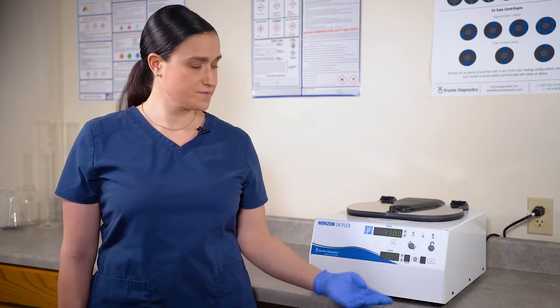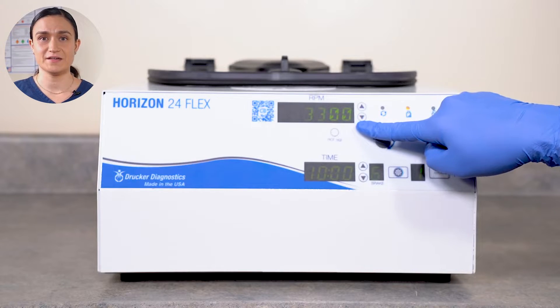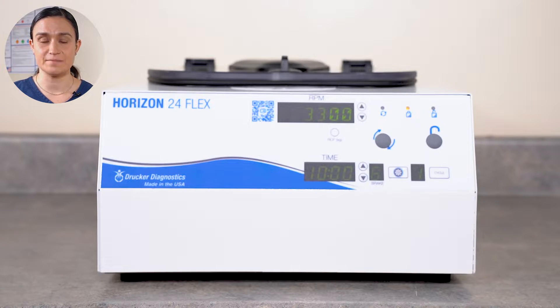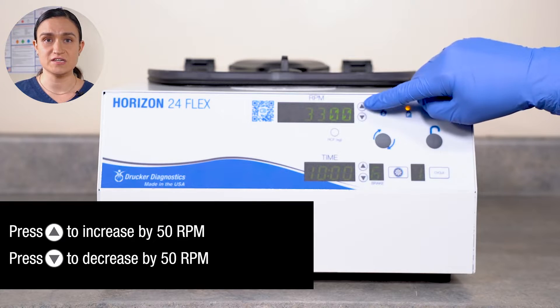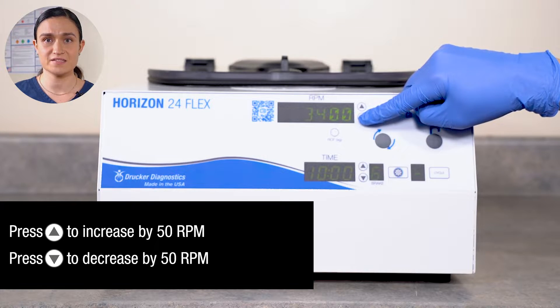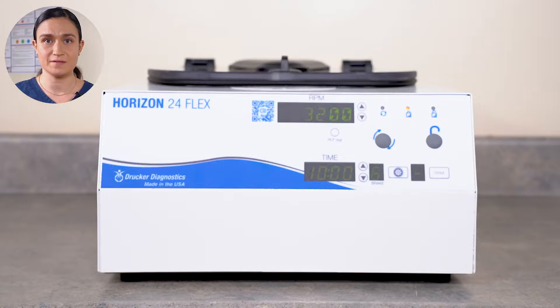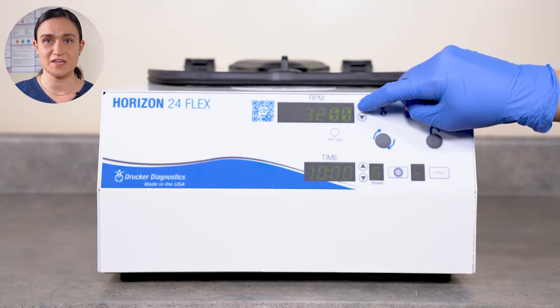When the tube holders are properly seated, you will be able to move them slightly — this is by design. That's what allows them to rise into their horizontal spin position. They do not click or snap into place. Your Horizon 24-Flex has only authentic Drucker Diagnostics parts, including the rotor and tube holders. You should only use authentic Drucker Diagnostics parts, as anything else may damage your centrifuge or even be dangerous. Now that we have our Horizon 24-Flex set up, we can look at our controls. Part 3: controls overview. Your Horizon 24-Flex has all of its controls right here on the front panel. The RPM screen displays the currently selected speed in RPMs. RPMs can be adjusted using the buttons next to this screen — a single press up increases by 50, and a press down decreases by 50. As we adjust, the RPM shown on the screen will adjust as well.